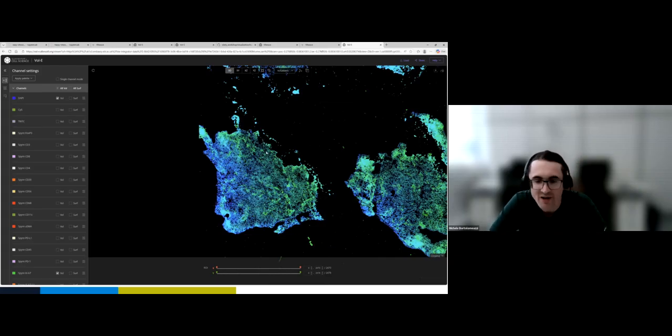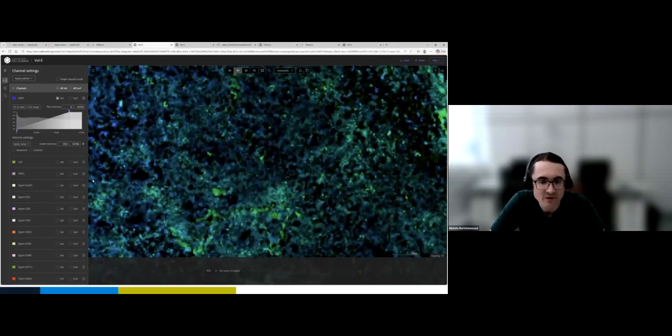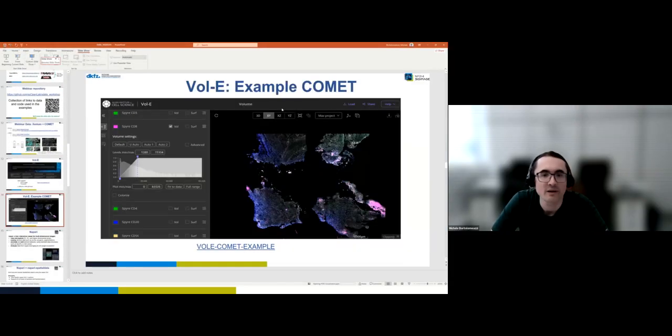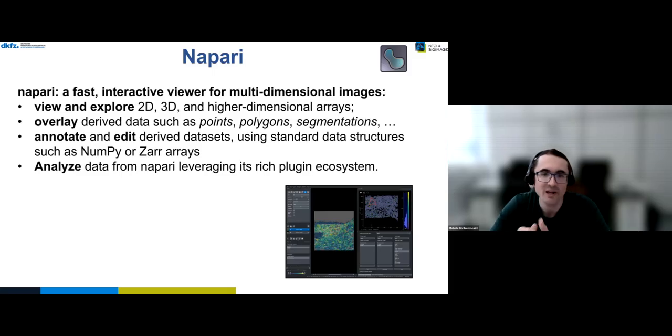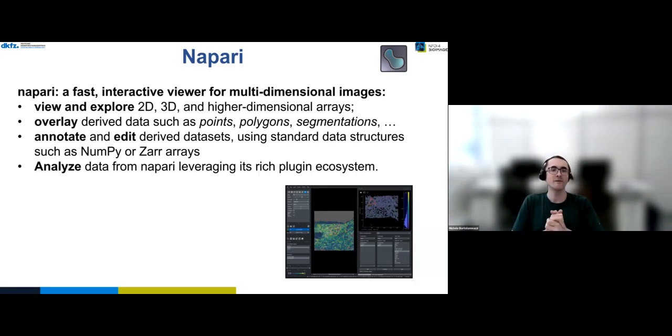So I'm going to move back to the slides, and then we can go forward with our next viewer. Okay, so now we are back on the slides. We have seen our Vol-E example, and I would like to instead move away from the web side of things and go on the desktop. I'd like to speak about napari.